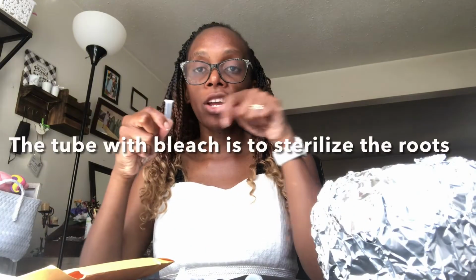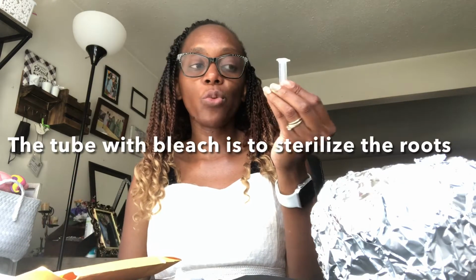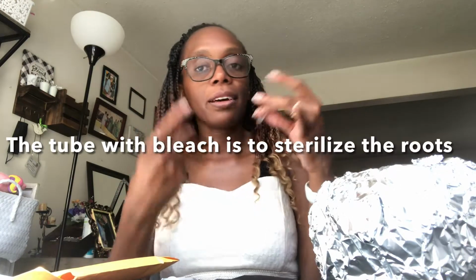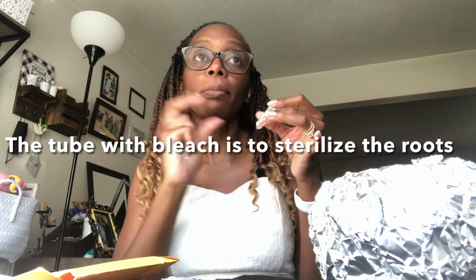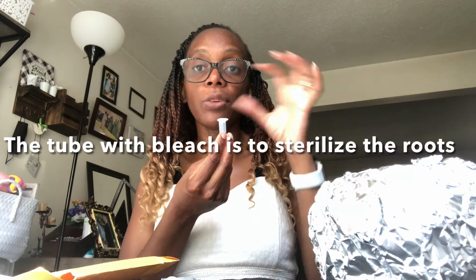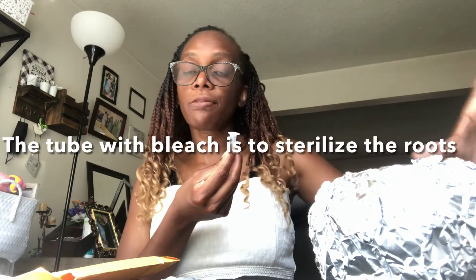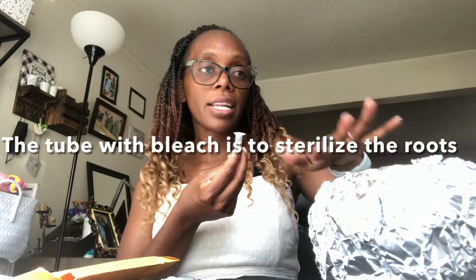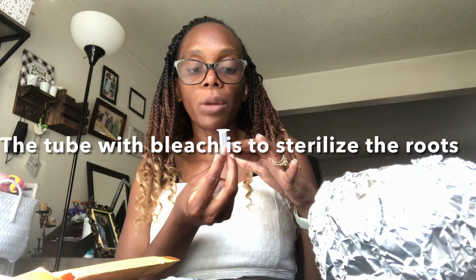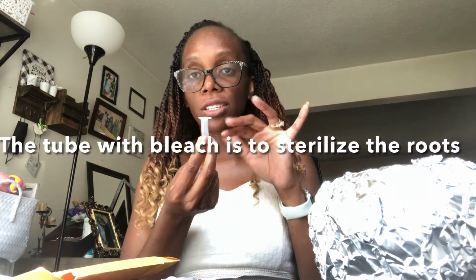And why do we crush that root segment? Okay, so first of all, why do we have to sterilize? We have to sterilize because we want to get rid of any other microorganisms that might be around or outside our little root segment that we're going to cut off. Because remember that this is coming from the soil. The soil contains many different microorganisms, good, bad, harmless, but we are only concerned about one particular type, which we know enters the plant roots.